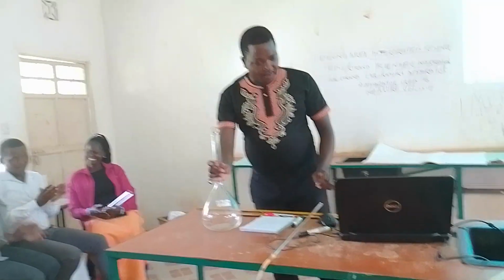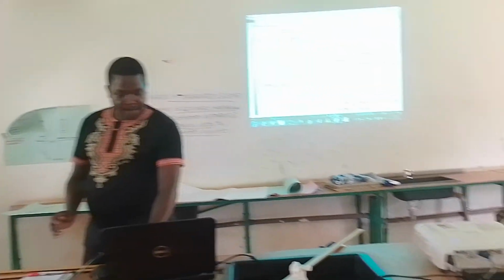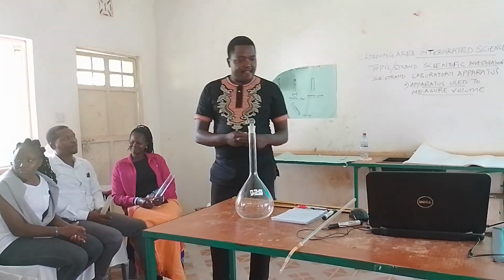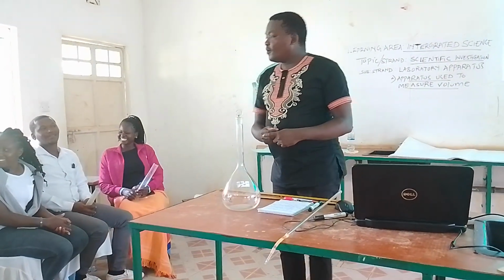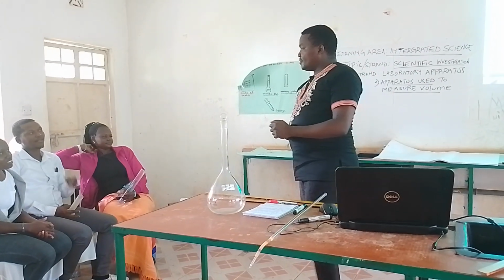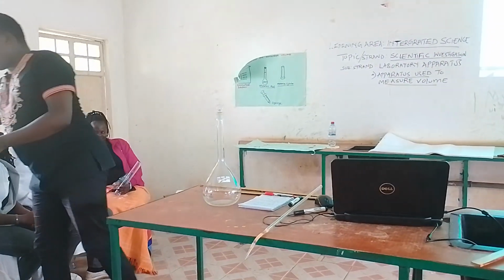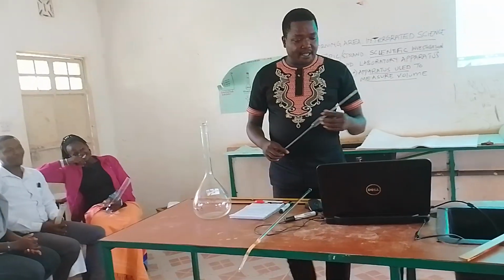Appreciate Caro. Okay. Then look at that apparatus. Yes, that one. Oh, Monta. What's the name of the apparatus? It looks like a ruler. Oh, you're saying you have a ruler? Okay. Somebody can tell her the name of the apparatus? Oh, it is a pipette. Don't be a coward. Be confident with your answers.